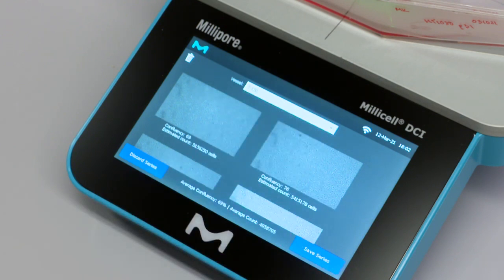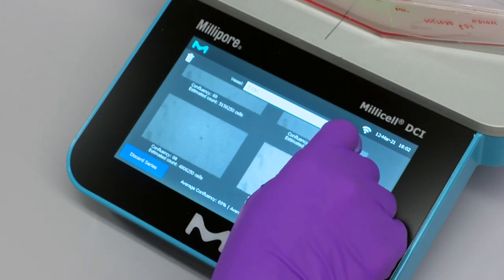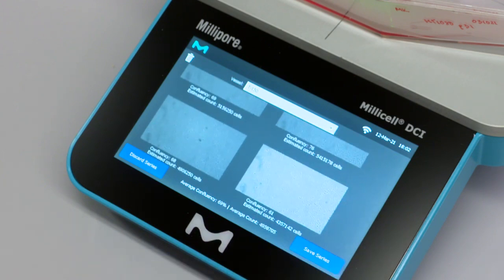The percent confluency and estimated cell count will be displayed beneath each image, as well as the average for each parameter at the bottom of the screen.